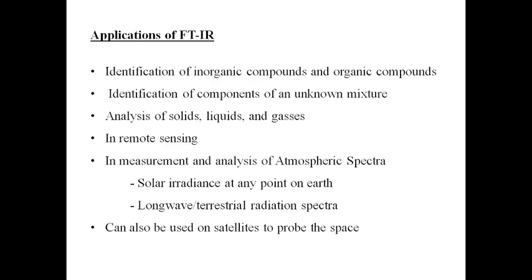So the applications of FTIR are identification of inorganic compounds and organic compounds, identification of the components of an unknown mixture, and analysis of solids, liquids and gases. In remote sensing, especially atmospheric spectra, it can also measure solar irradiance. So sun radiation can also be measured with the FTIR because it has the best library databases. You can compare the signals with the already fed library data of the functional groups. Long wave terrestrial radiation spectra can also be used. It can also be used for satellite checking.